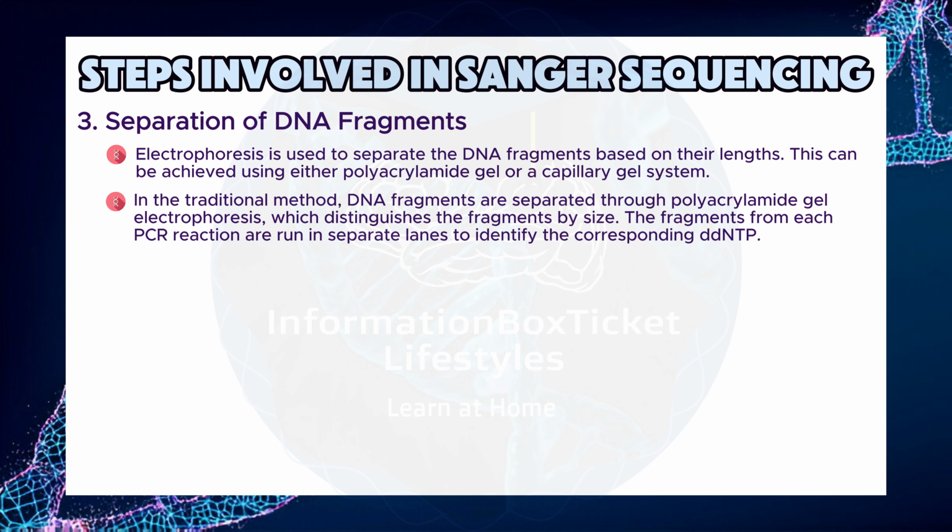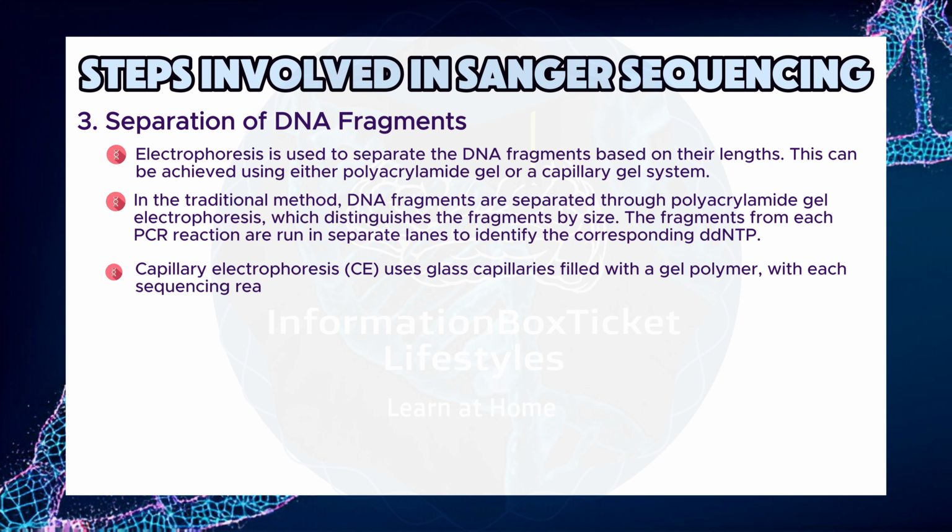The fragments from each PCR reaction are run in separate lanes to identify the corresponding ddNTP. Capillary electrophoresis, CE, uses glass capillaries filled with a gel polymer, with each sequencing reaction being run in a single capillary.